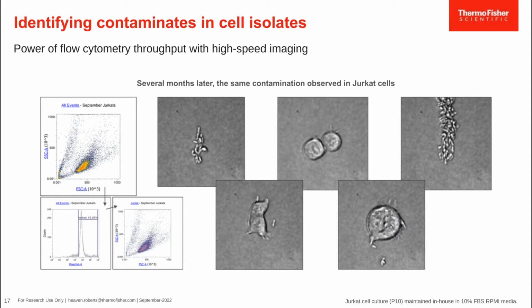same media. So we spoke with our cell culturist, and she mentioned, yeah, our Ramos cells we thawed last week didn't survive cryopreservation. This isn't entirely abnormal, so we just thought, well, maybe the thaw wasn't good, and had tossed that particular vial of cells, and she had started thawing another. We can see here the Jurkat cells are doing much better with this contaminant than the Ramos were, but we still have some of those really clustered pathogen events.